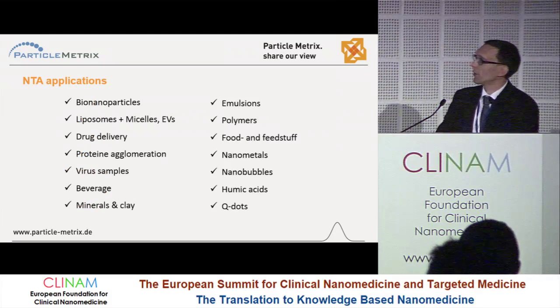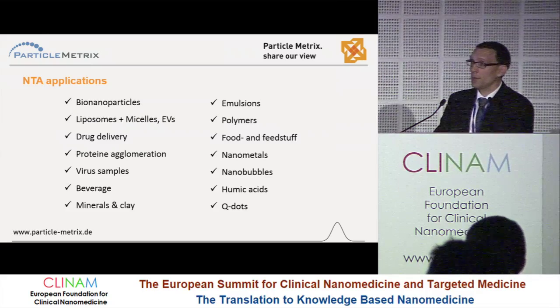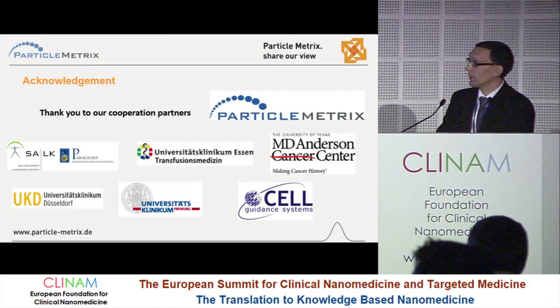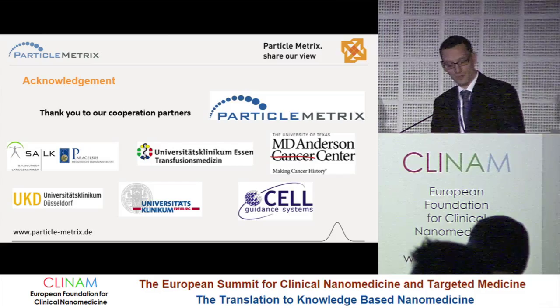It also works for all kinds of bio-nanoparticles, polymers, nanometals, and nanobubbles. This is an emerging field in Asia. And we are able to measure even in distilled water with no salt background at all. So having said this, I want to say thank you to our cooperation partners and thank you for your attention.